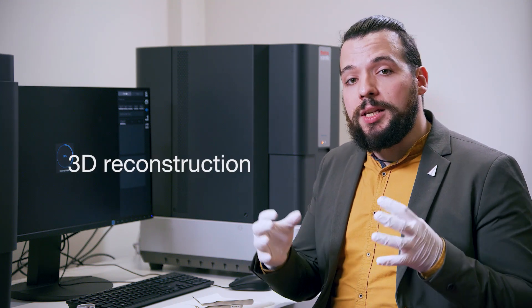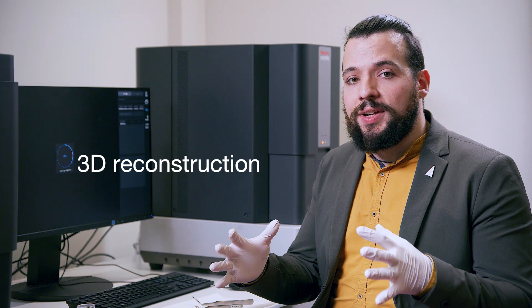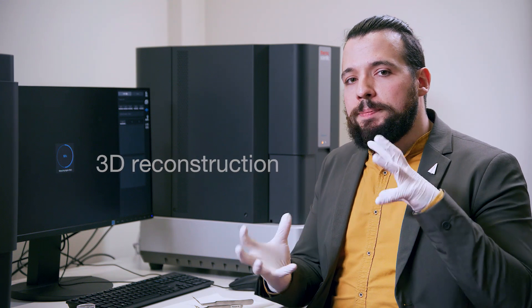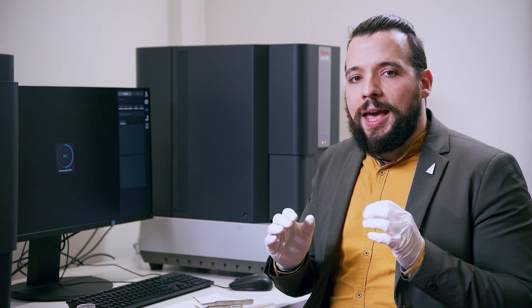These shadows are measured, and by using a technique that's called shape from shading, we can create a 3D model of the surface that we can use to inspect the sample, navigate it around, and eventually trace roughness profiles.